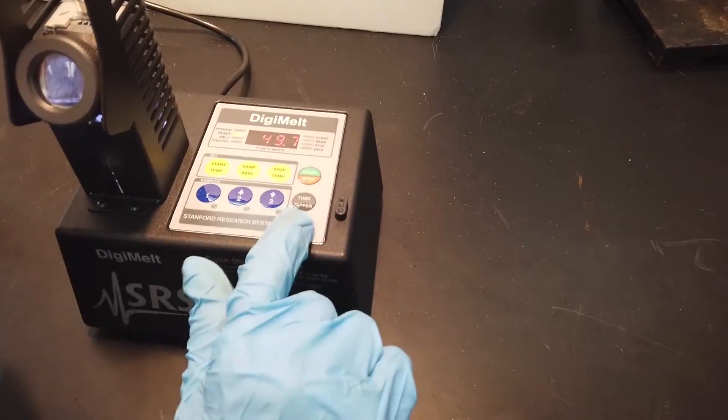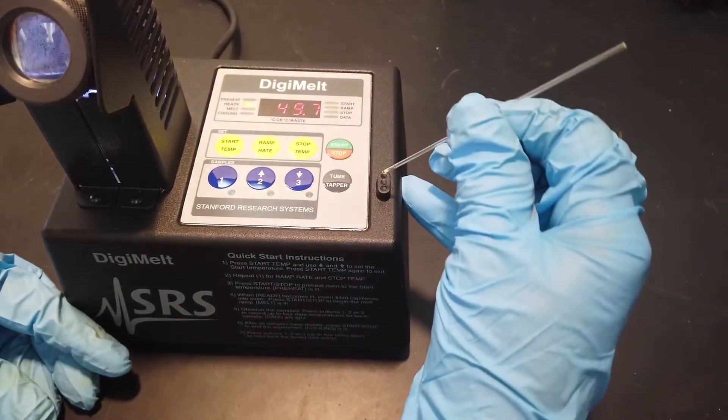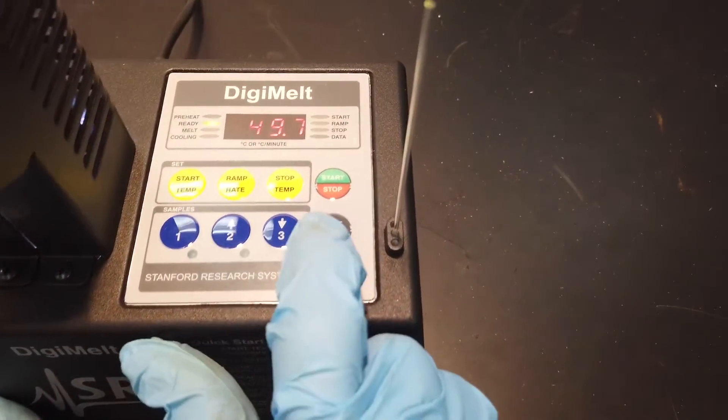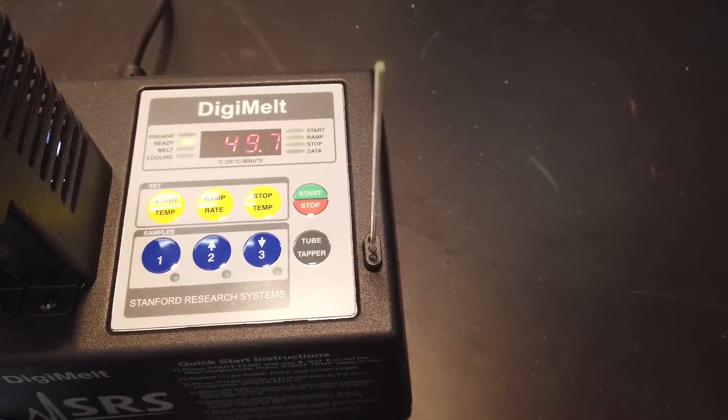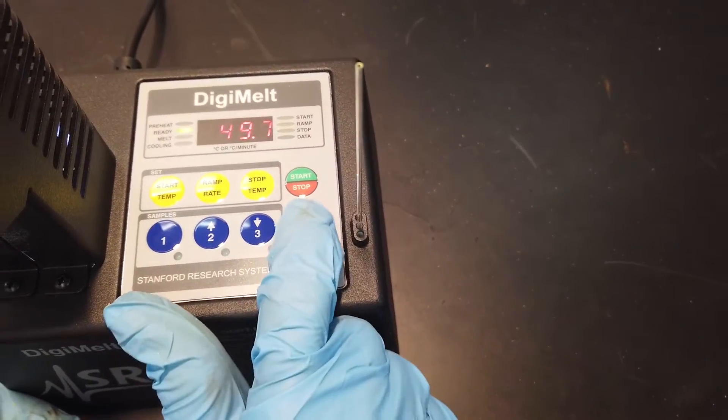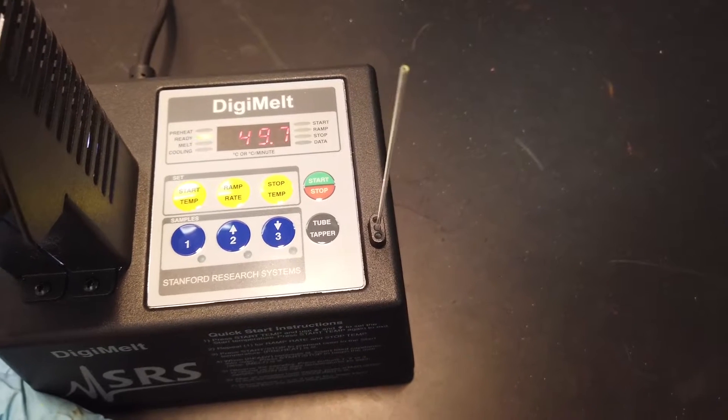You can also use the tamper on the side of the Melt-Temp. Place the capillary tube into the tamper and press the button. It will automatically stop after a few seconds. You can repeat this process as many times as you need to get the solid to fall to the bottom of the capillary.